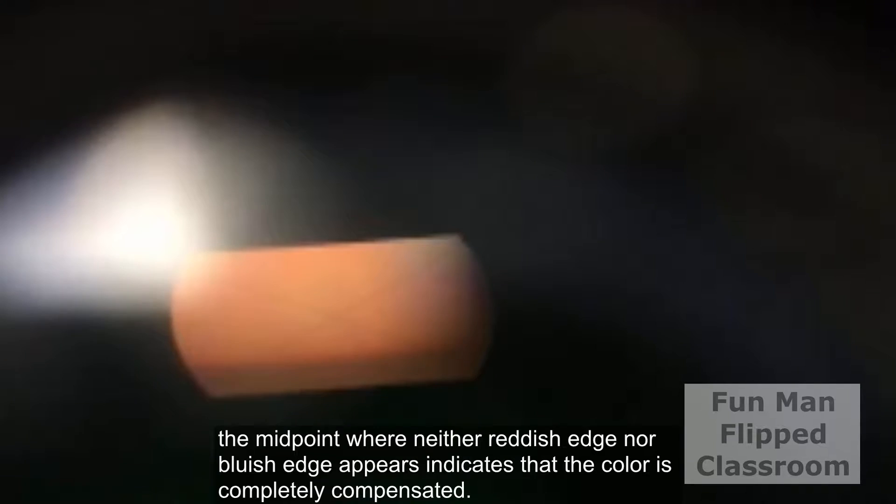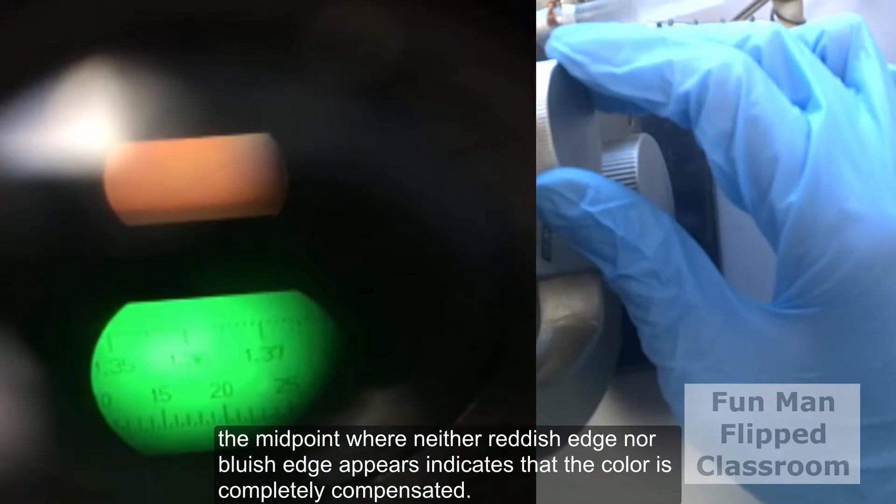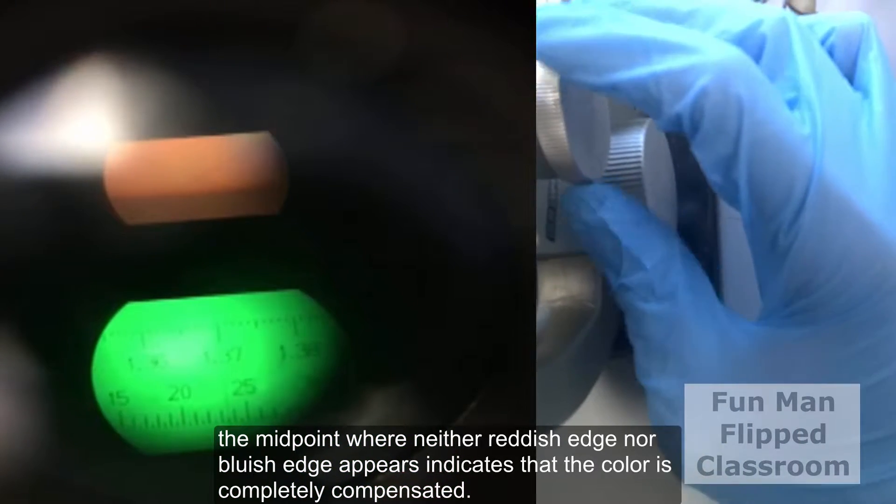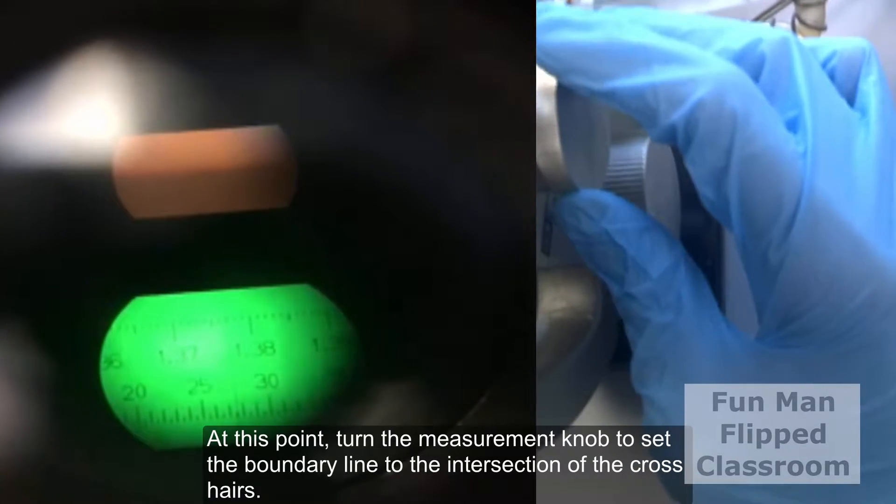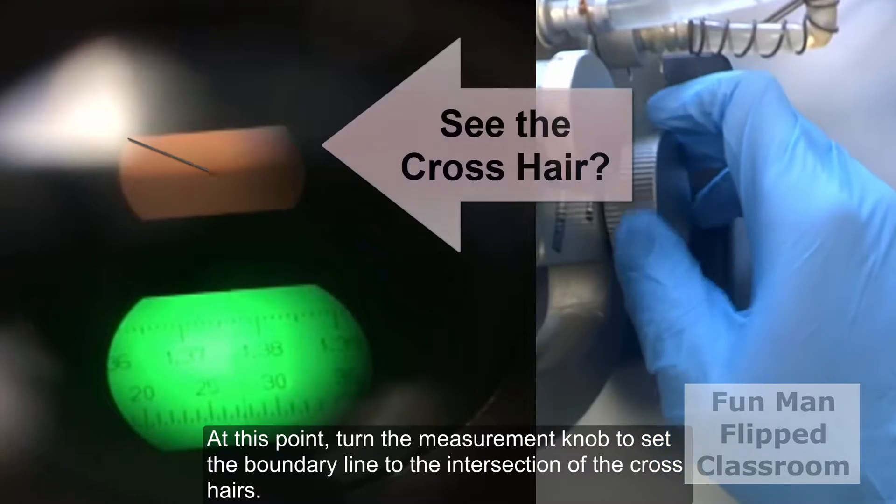The midpoint, when neither reddish edge nor bluish edge appears, indicates that the color is completely compensated. At this point, turn the measurement knob to set the boundary line to the intersection of the crosshairs.